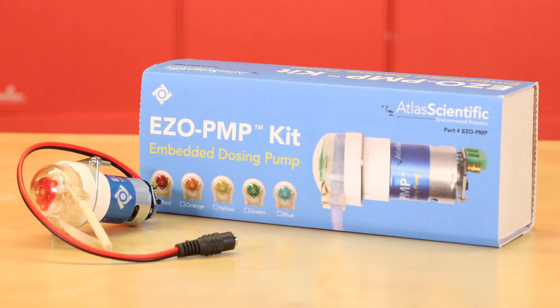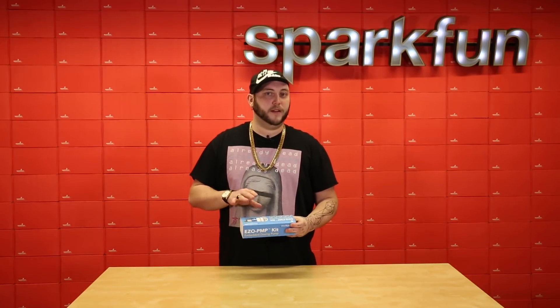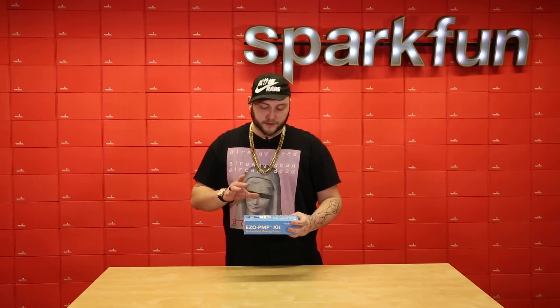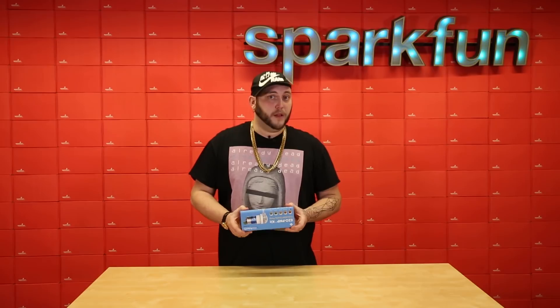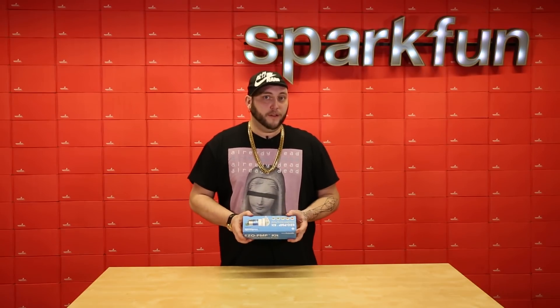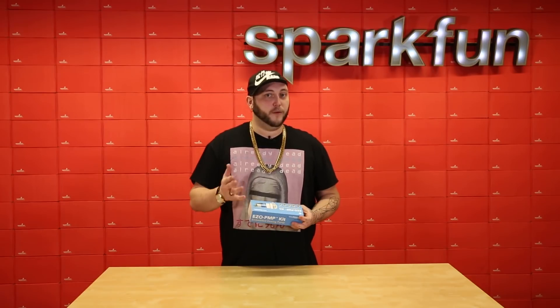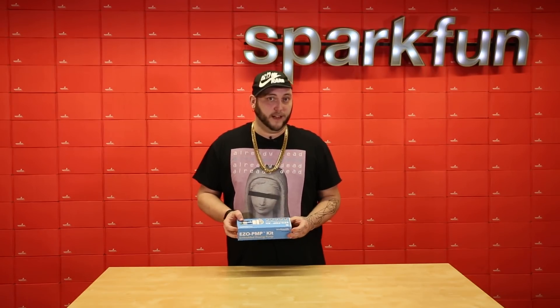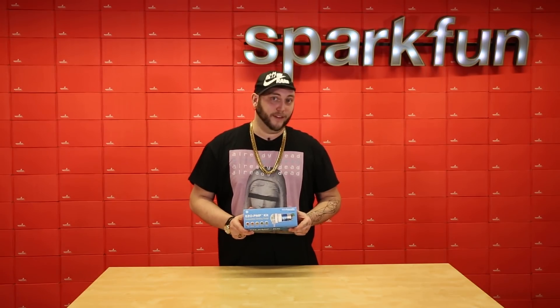Small dosing pumps are dirt cheap on the internet, admittedly, but Atlas Scientific has put a lot of work into making sure that both the control board and the calibration process for this pump are repeatable and reliable. I don't think you can do better than this at this price range. So if your project needs accurate dosing or titration, definitely look into the EZO PMP kit from Atlas Scientific.